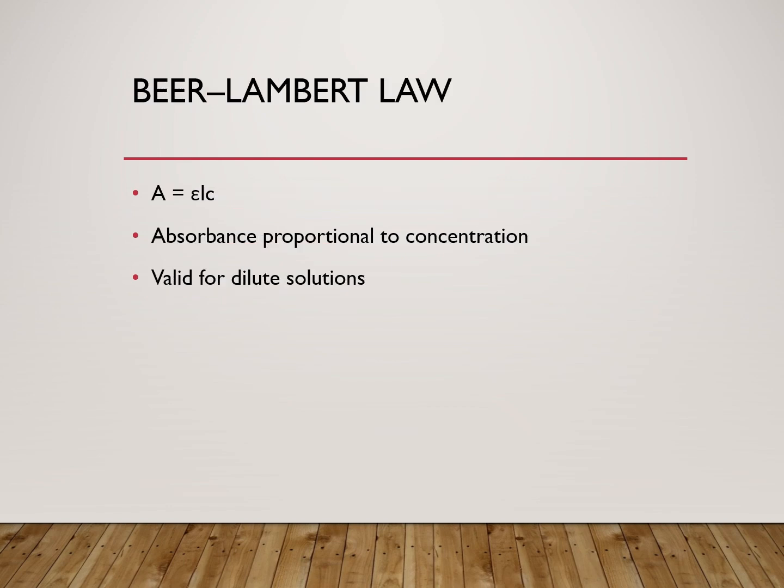Now, what is the Beer-Lambert law? The quantitative measurement in atomic absorption spectroscopy follows the Beer-Lambert law, which states that absorbance is directly proportional to concentration and path length.